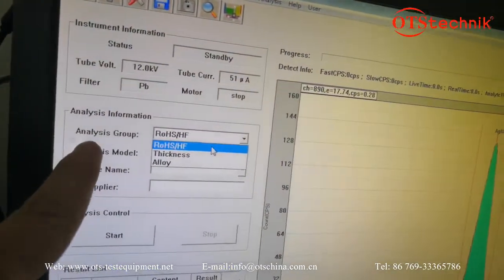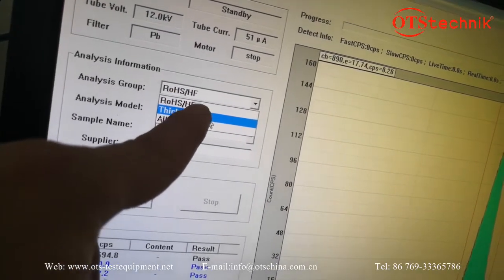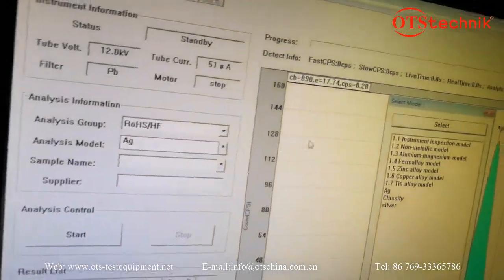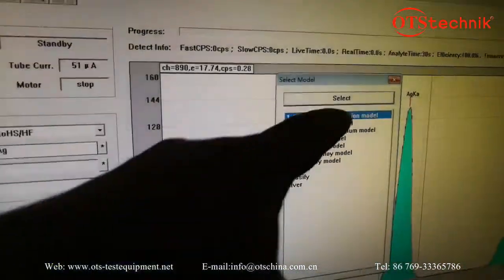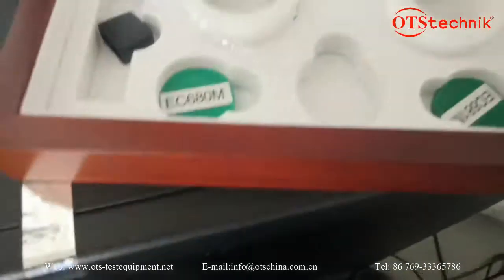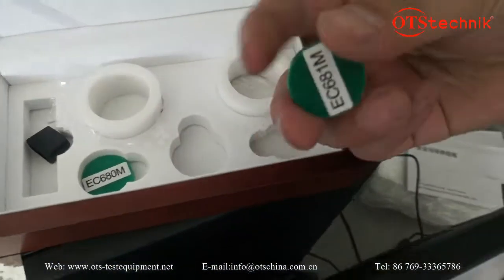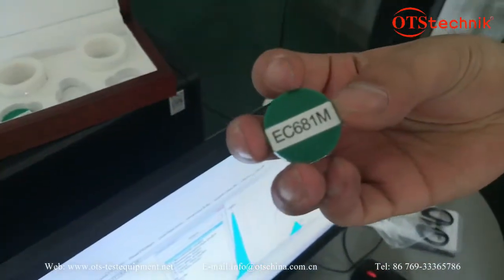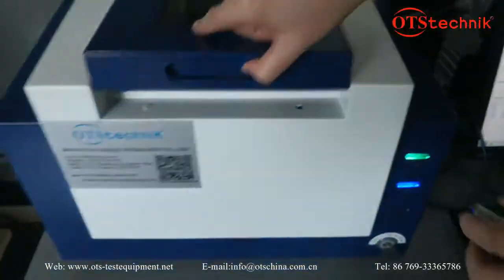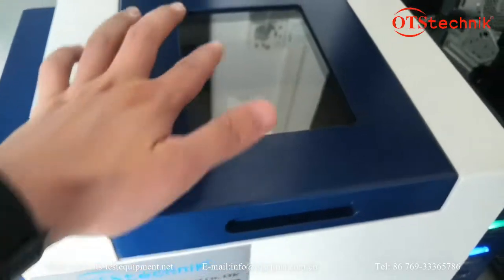This indicator is the power indicator light — the running light. The next step: you can select an analysis group. We can choose RoHS, effect, HF thickness, and others. For example, let's choose RoHS. This instrument inspection model can be used to calibrate the machine.